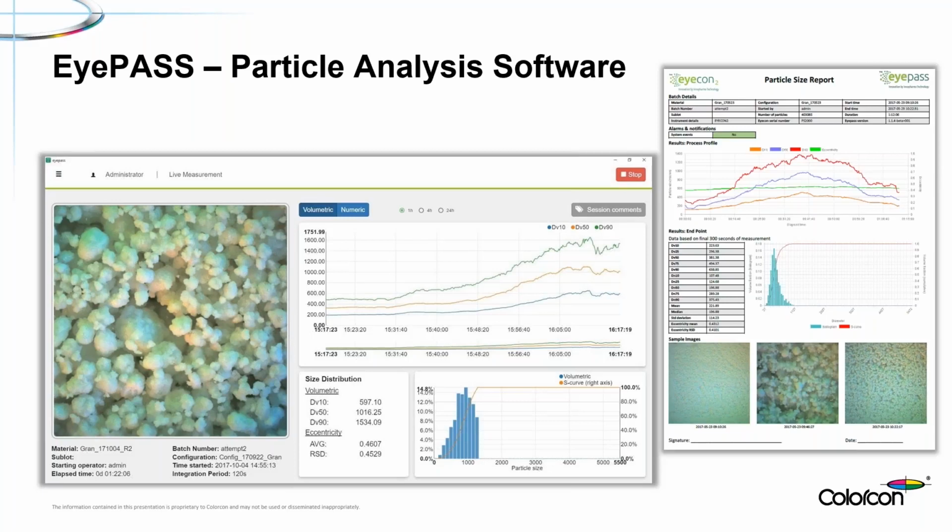And I won't go into any great detail here, but on the left, you can see the real-time image from the Icon, which is essentially giving you your real-time inline microscopy for free. So we can tell a huge amount from the way the material appears in that image. Subjective, certainly, but very, very useful to a skilled or experienced operator.